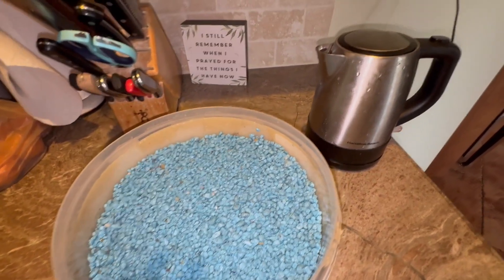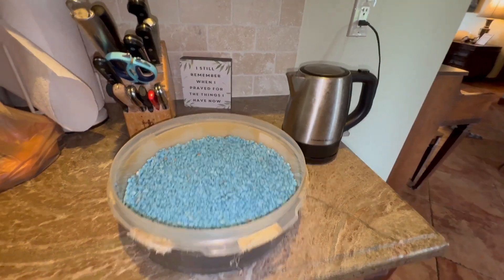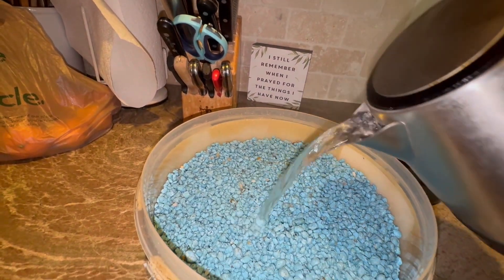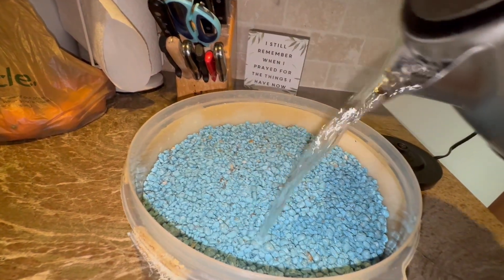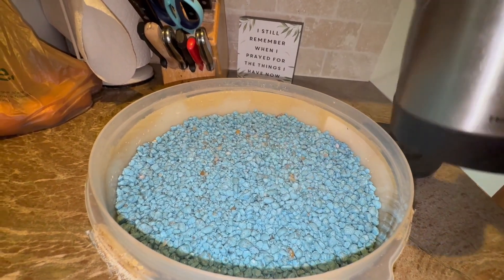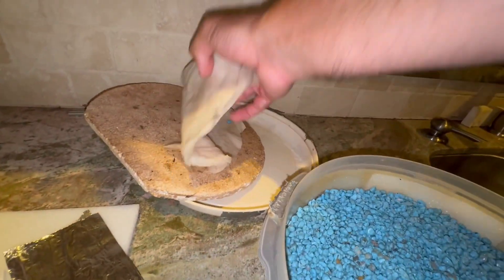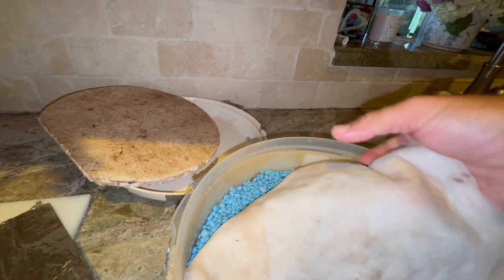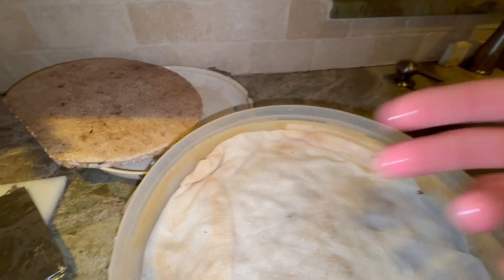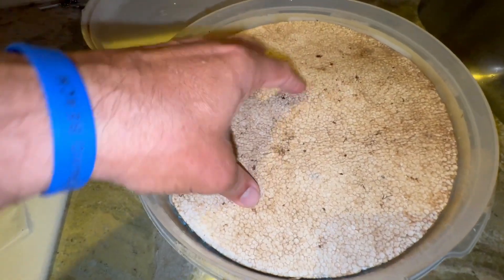I'm going to steam these guys up. My water's boiling, and I'm going to just pour the water in here. Then I'm going to put a paper towel over the top just to keep stuff from falling into the rocks — it's easier to pick a specimen off a paper towel — and of course my trusty piece of styrofoam here.